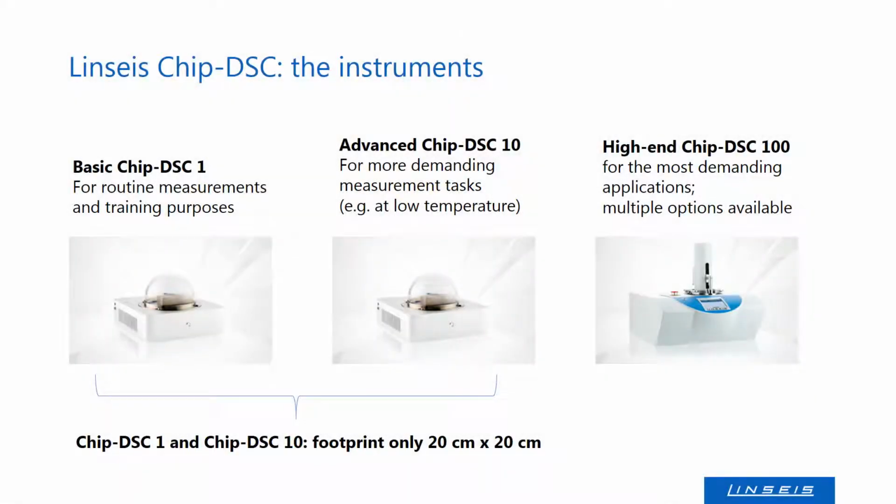The new technology is integrated in the new LINSEIS Chip-DSC series consisting of the following models. There's the basic version, the Chip-DSC 1, the more advanced model Chip-DSC 10 and the high-end version Chip-DSC 100.